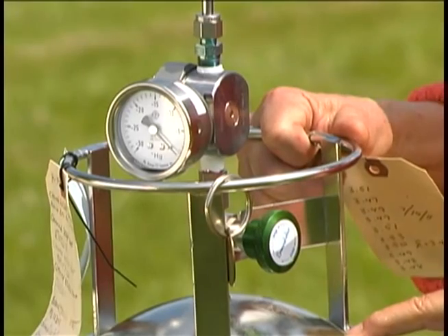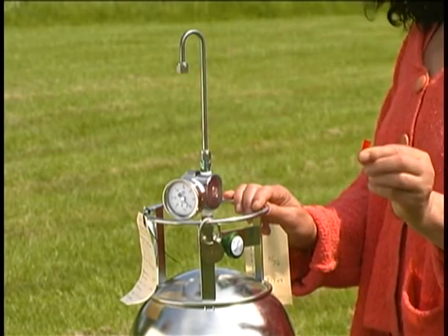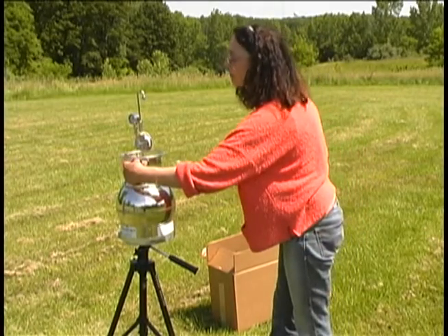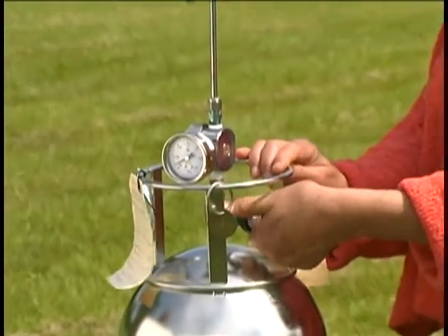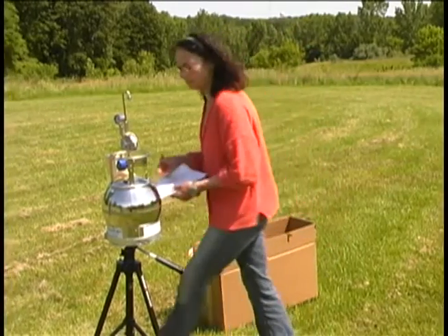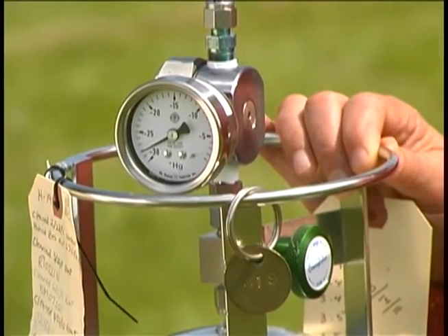Step two: remove the red plastic tip at the end of the sampling cane. Record the start time. Open the canister valve completely by turning the canister valve counterclockwise no more than one full turn. This knob should not fall off. Record the pressure from the gauge. Wait with the canister for one hour.